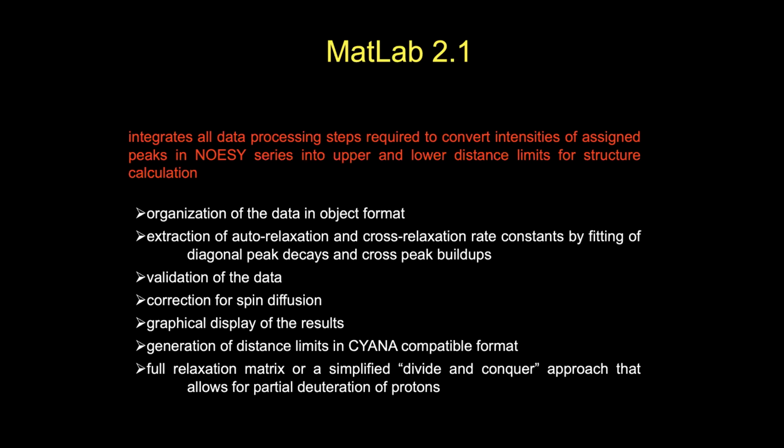And what we have found out is that your deuteration is never perfect. This may be typically 99% or something like that. This sounds like no problem, but in large systems, these residual 1% protons can boost your spin diffusion. This is very severe. I was surprised myself. And we can account for this with the simple approach.